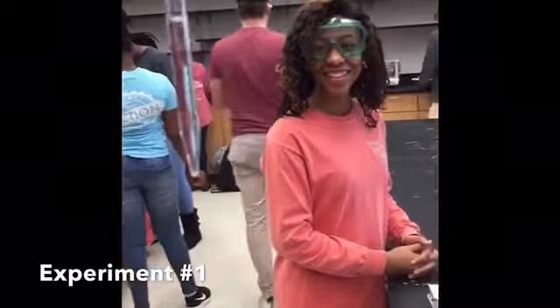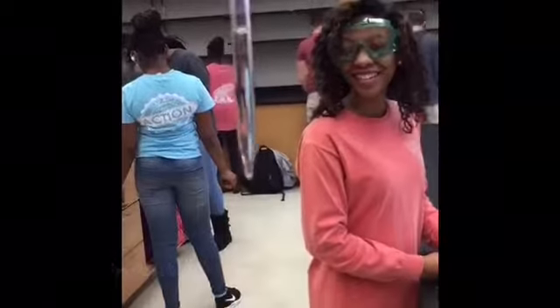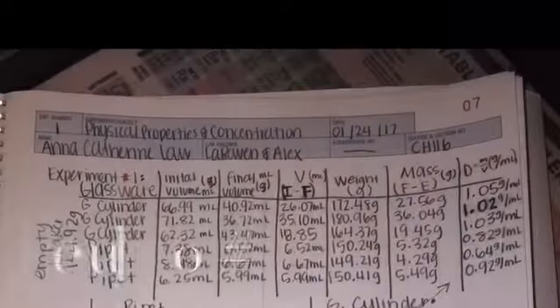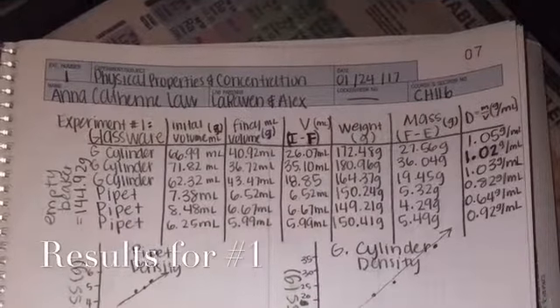And what's that, Anna? The meniscus. Yeah, the meniscus. So the reading... 9.87.